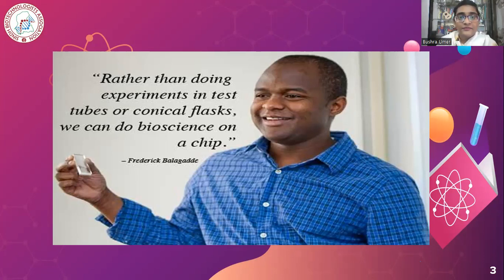Because when we perform an experiment on a chip or in a small space, we are reducing the time, since it is easy to control the sample which is present in a small amount. So we are reducing the time taken to perform that experiment.